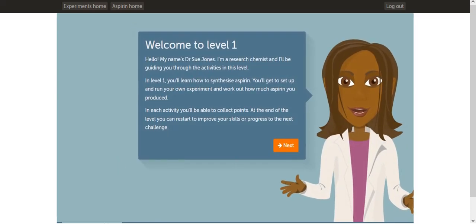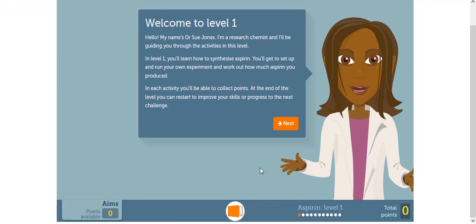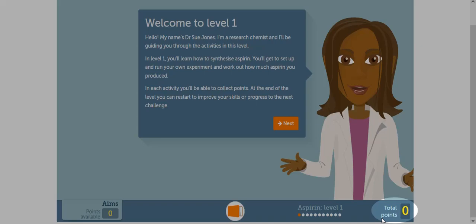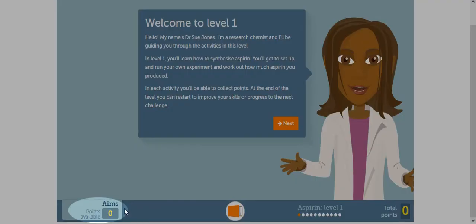Before we start this virtual lab, let me first show you how to check what stage you're on in Level 1, how many points you collected, and how to download the lab PDF. If you scroll down a little using a mouse, you can check what stage you're on in Level 1. There are 11 stages in Level 1, and we're currently in Stage 1. On the right is the total points you have collected, and on the left is the total points available in each stage.